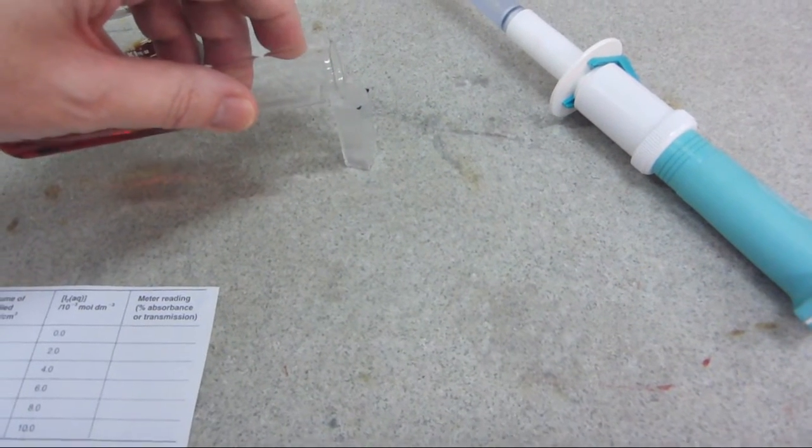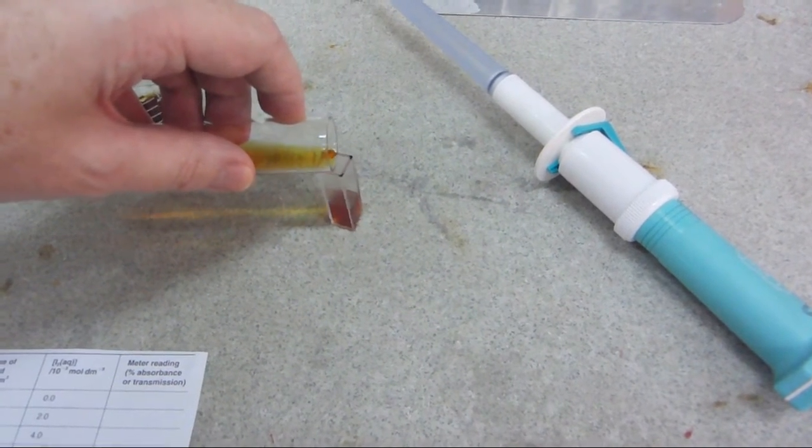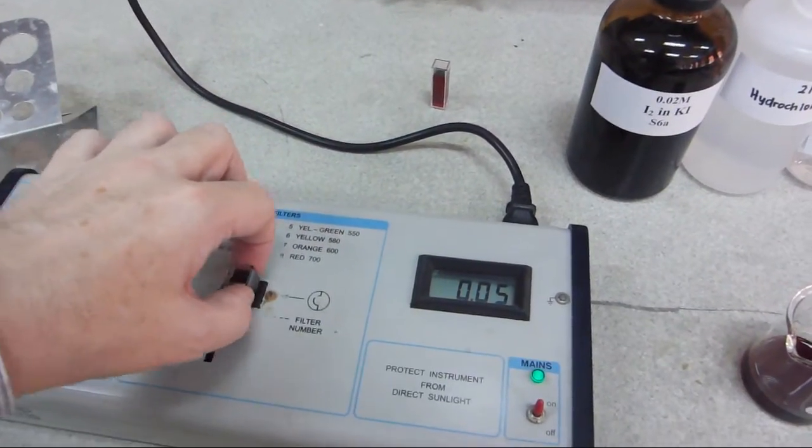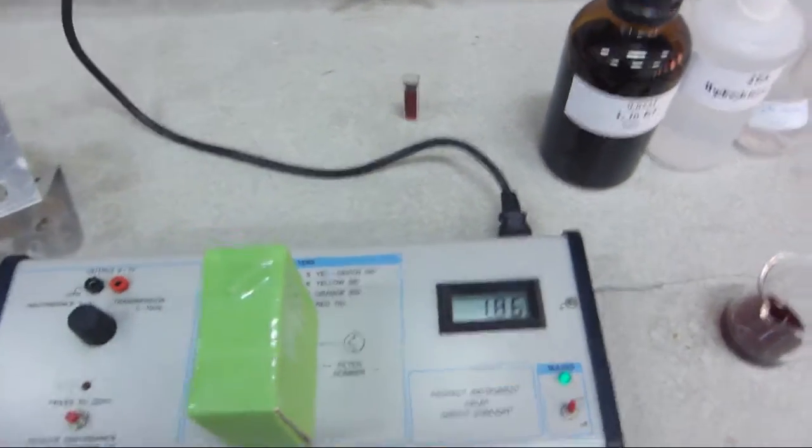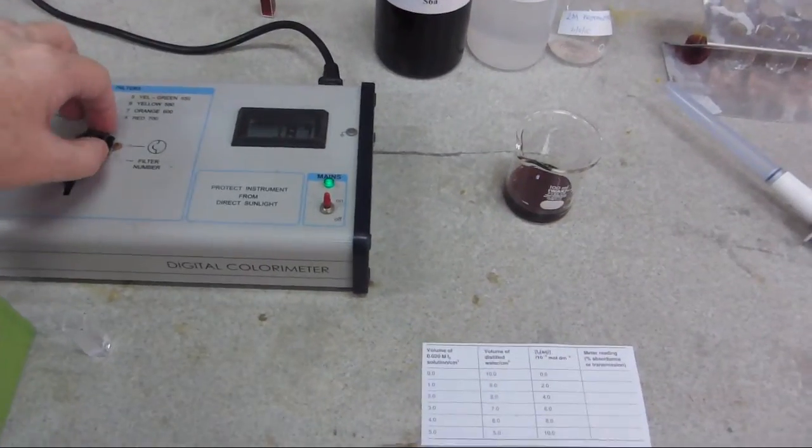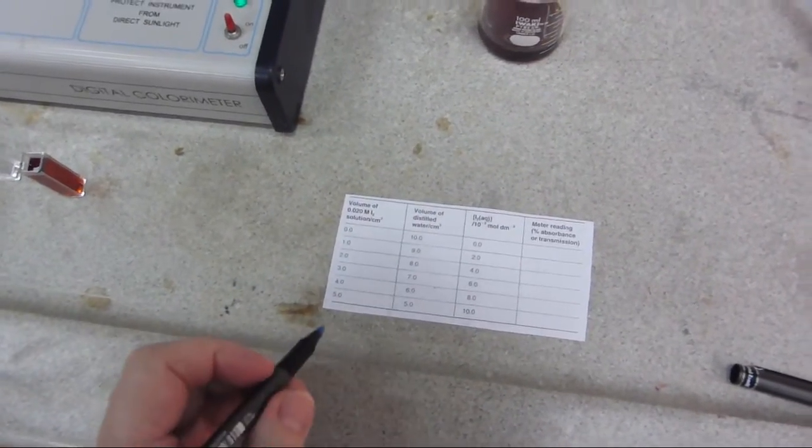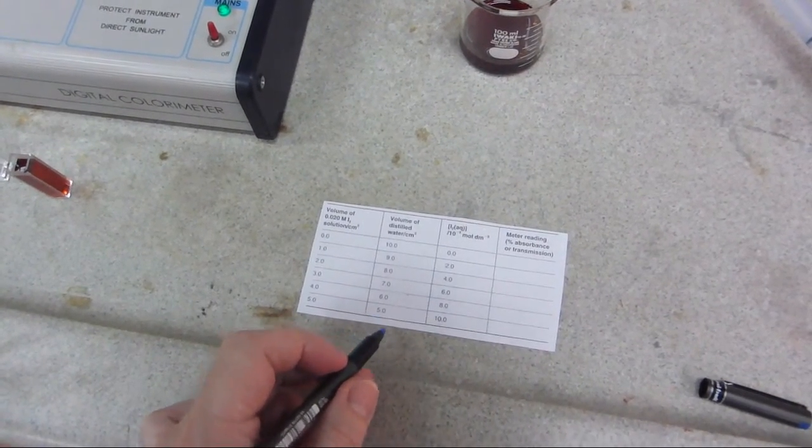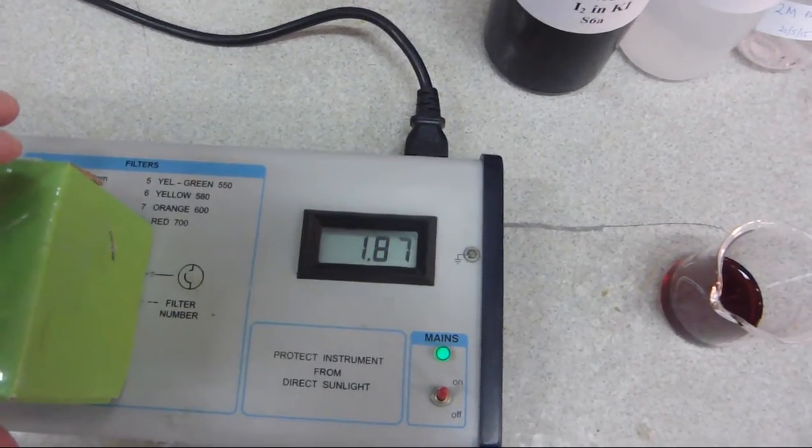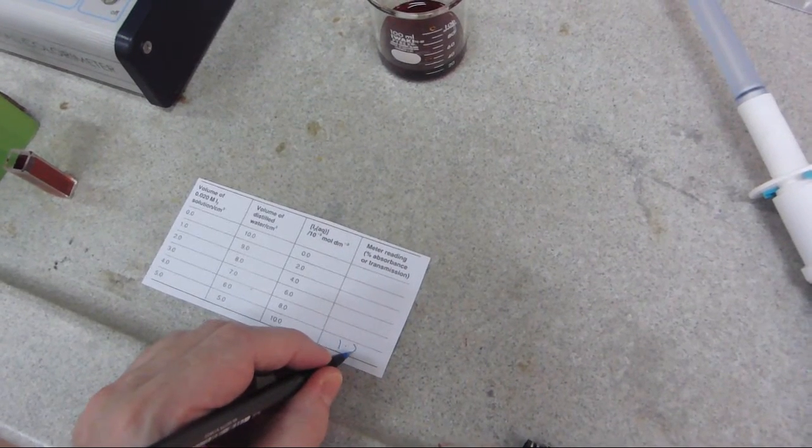I haven't got a pipette, so I'll attempt to pour this in. As long as I don't spill any down the side of the cuvette, we'll be fine. Success. Place that in the colorimeter, extinguish the extraneous light, and you can see that the reading is 1.86, 1.87 absorbance units, so it is on scale. Now I need to record that in the table of results. For five centimeters cubed of the 0.02 molar iodine plus five centimeters cubed of distilled water, we've got a reading of 1.87. My writing with my left hand, none too clear.